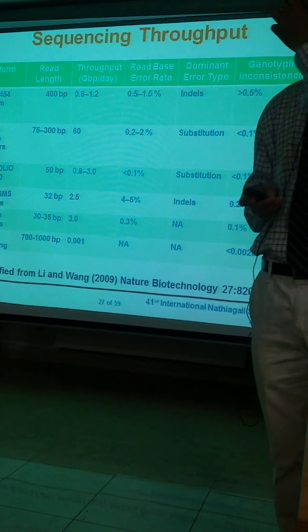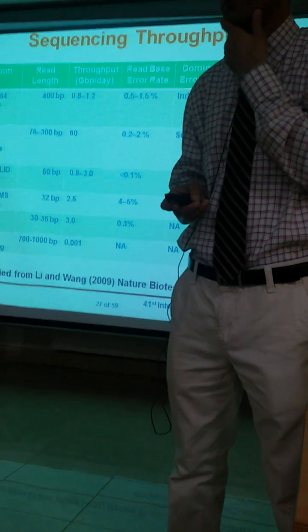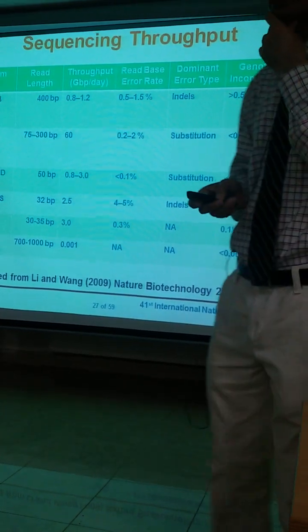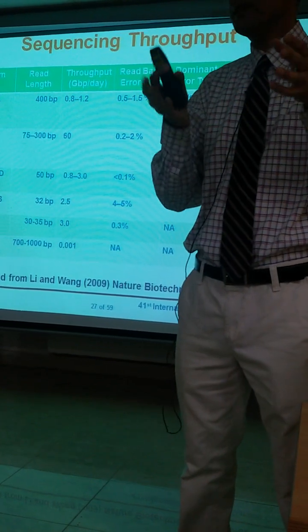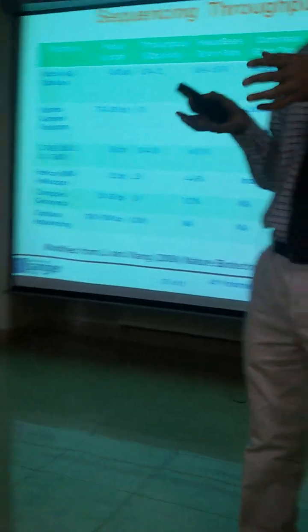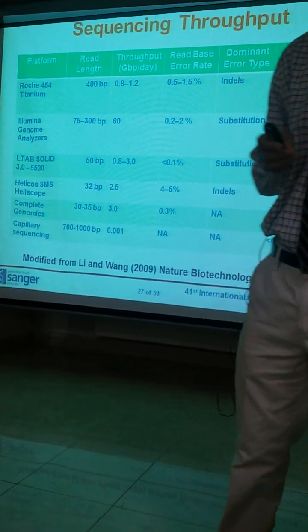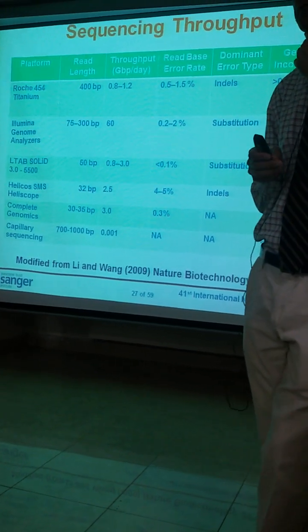So basically, what is your interest? Human or not human? I'm basically computer science. Okay, so let's say you sequenced a human genome, and let's say you've sequenced one which was sequenced by 1,000 Genomes. You take that sample and compare the variant calls with 1,000 Genomes. If the error rate is anything more than 1%, I would say that your sequences, or your variant calling, is not very good. Because you need to be as good as the one which has been published.